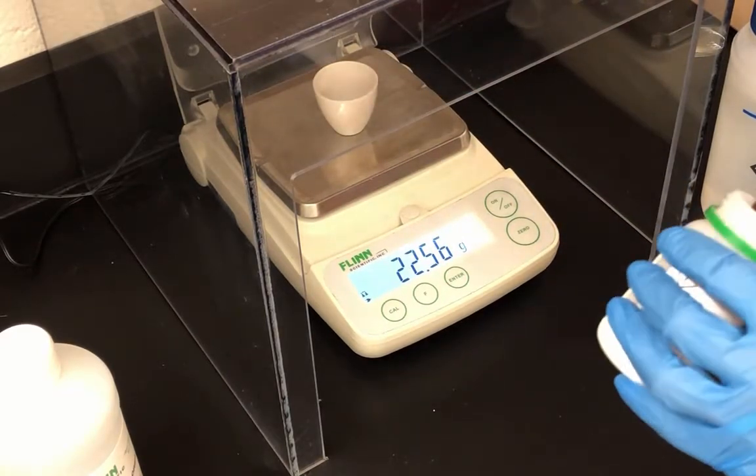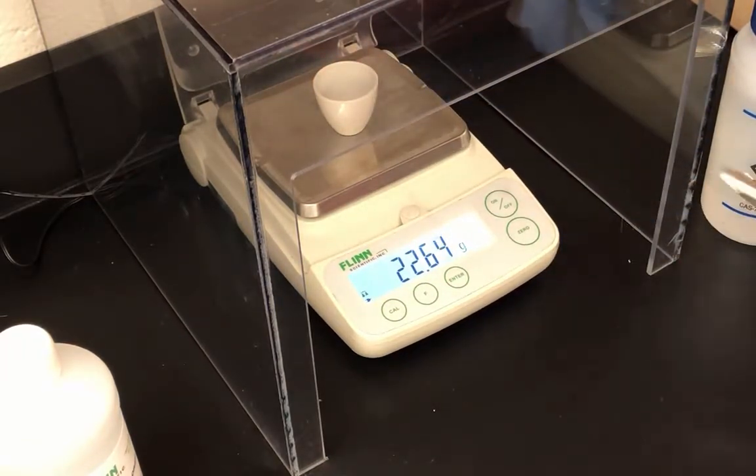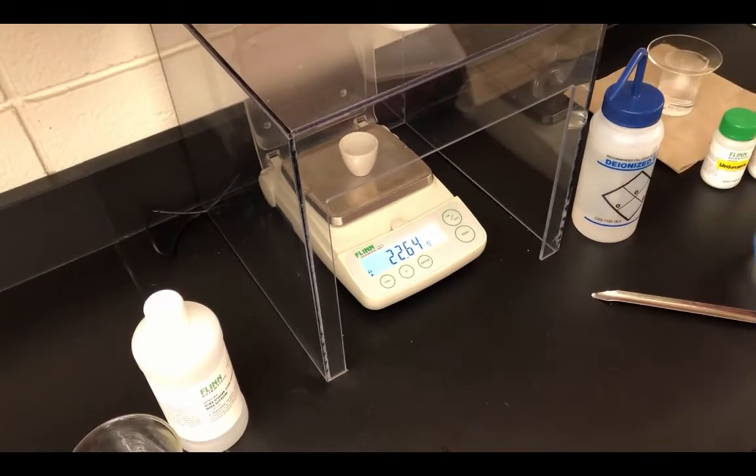If it's a little less than 2 grams, that's okay. So I'm going to stop here, 22.64 grams. Make sure that you write down that we used unknown 1, and unknown 1 has a mass of 22.64 grams with the unknown and the crucible.